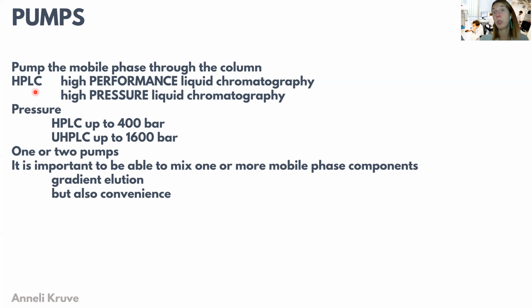HPLC, which we often use as an abbreviation for liquid chromatography, actually means high performance liquid chromatography, meaning that the resolution in this chromatography is very high.